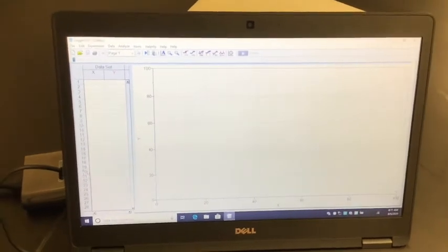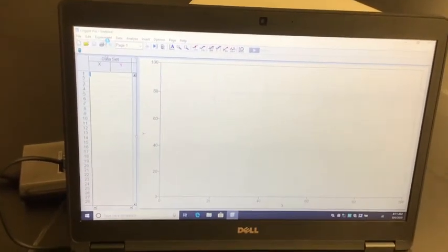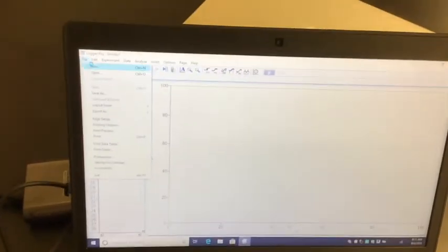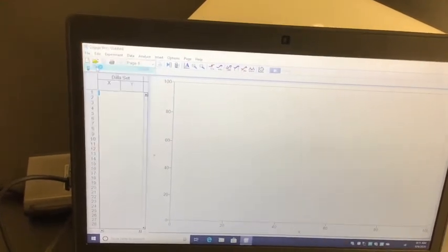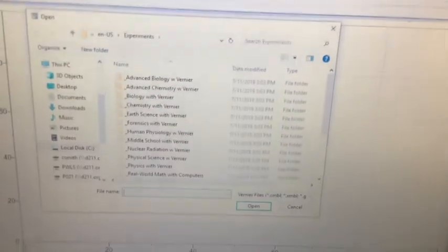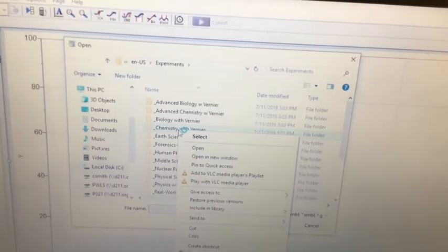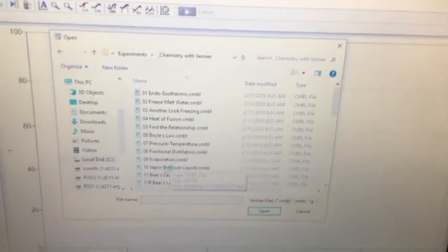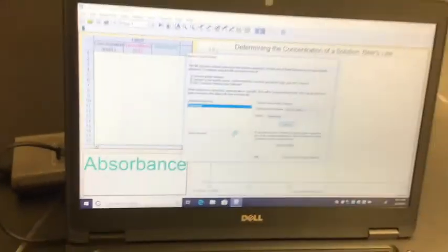Now we need to connect the device itself, so go to File and open whatever program you are working with at this particular moment. It will probably take you to a file browser. Go to Chemistry with Vernier — that's probably where you'll want to go. Today we're going to do Beer's Law, so I'm going to open up the Beer's Law file.